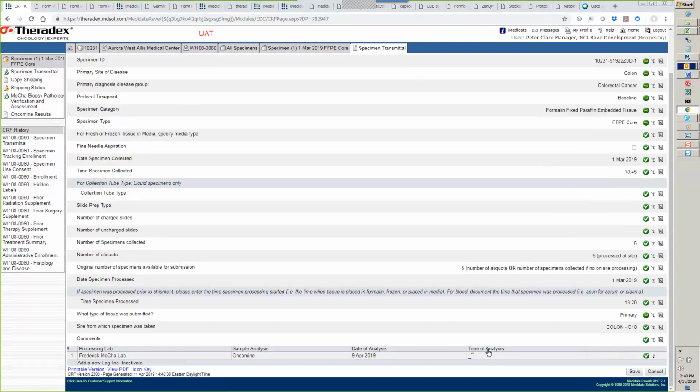Okay, great. And Peter, this is Michelle Rudek, and I guess this is something that we've developed in our own database that we use on site that isn't linked. But in our case, we're running potentially 40 plus samples at one time in one assay. So more than likely one patient's worth of samples are analyzed on the same date.